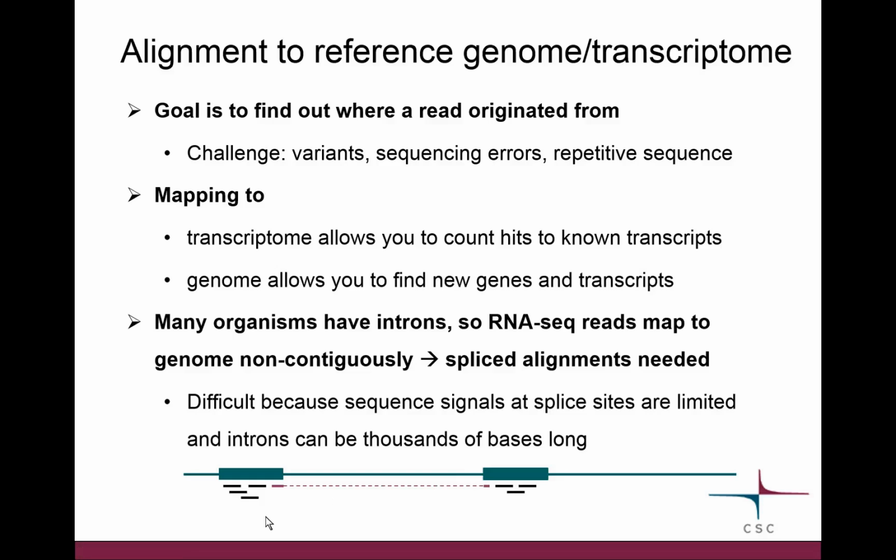We extracted the RNA and sequenced it, and we have little reads, which are the black bits, or these little sticks. Some of the reads, if they come totally within an exon, will of course match happily. But then some reads, like the purple one here, match so that the beginning part of it matches to the first exon, and then the last part of it matches to the second exon.